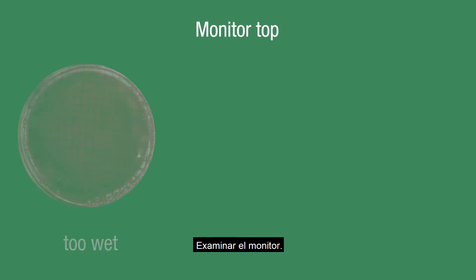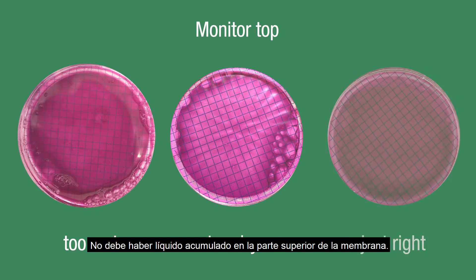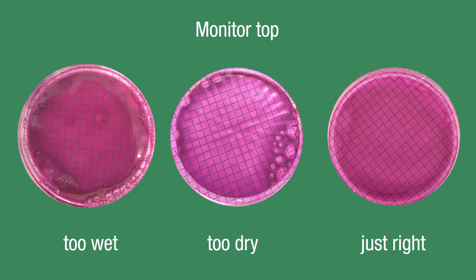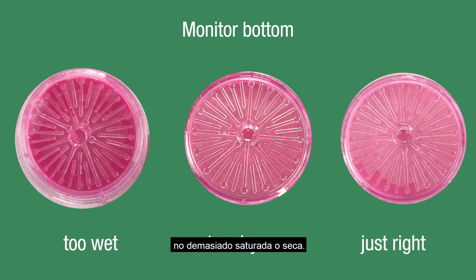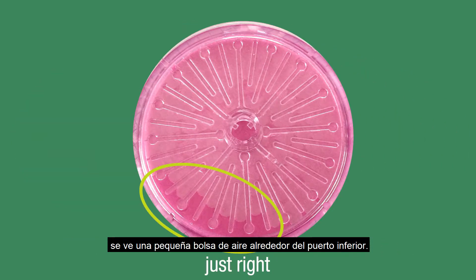Examine the monitor. There should not be liquid pooled on top of the membrane. When inspected from beneath, the pad should be moist — not oversaturated or dry. If you've performed this step correctly, you'll see a small pocket of air around the bottom port.